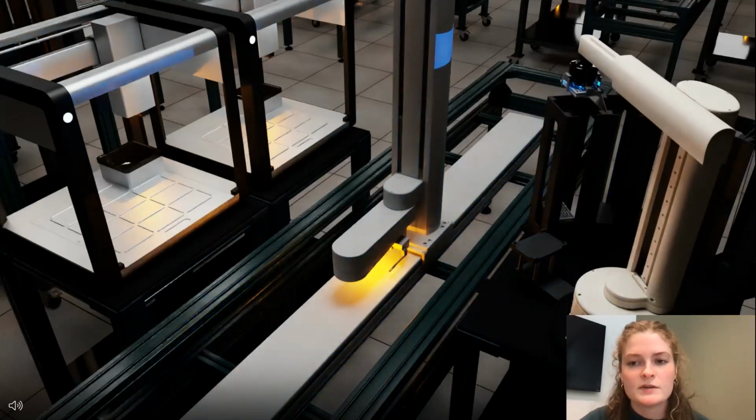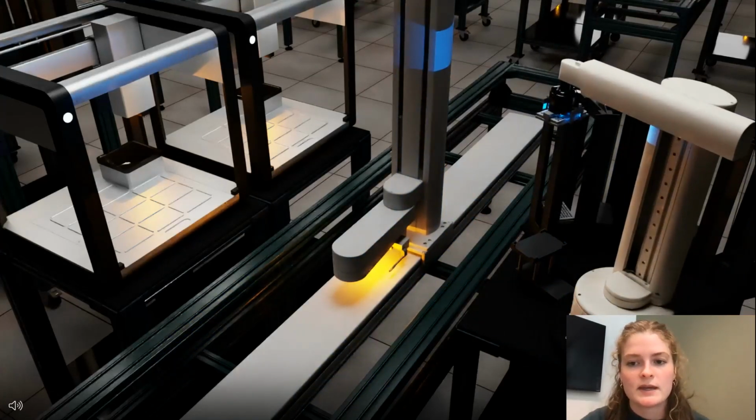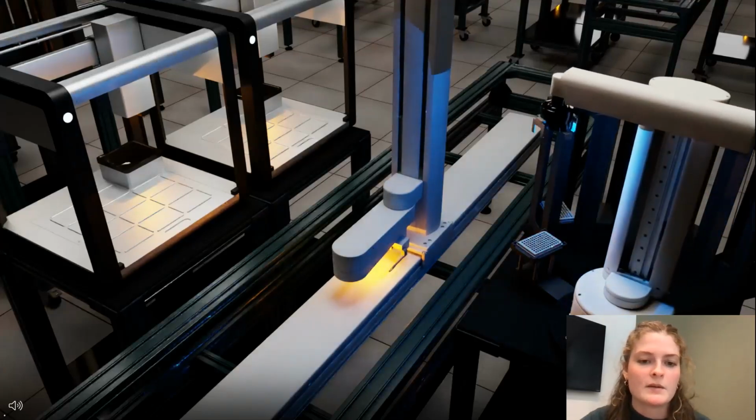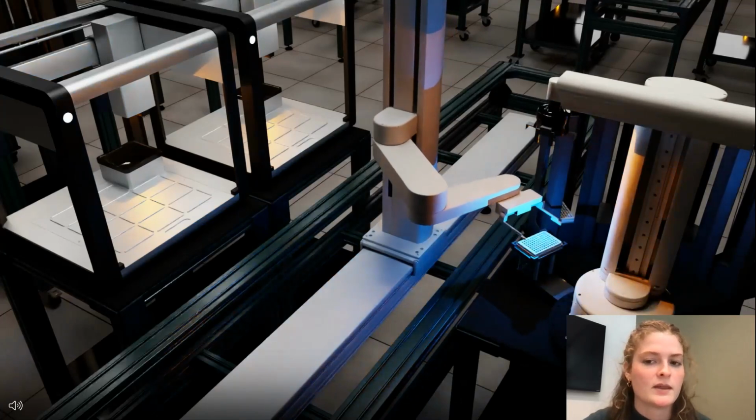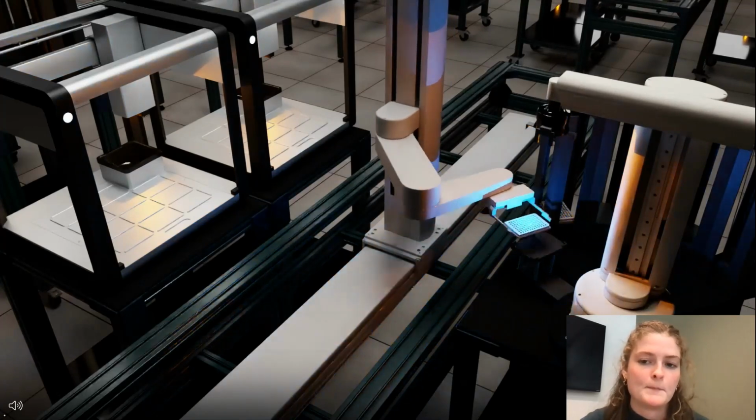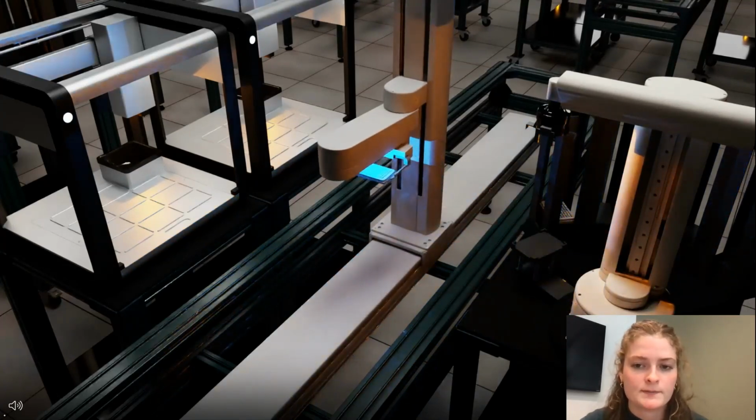So what we can do with these virtual work cells is map out the movements of each robot and make sure that they're working together in the way that we expect them to when we run our workflows.